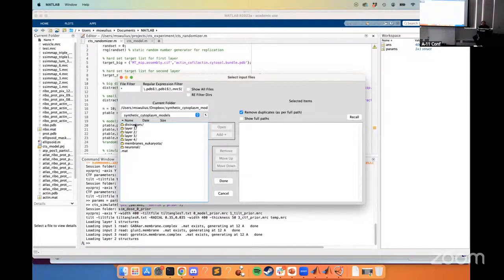Okay, you see how I have this folder called distractors? It's basically a copy of the other 4 folders. But if you open them up, every file has the word distract in it. And if you pass those PDBs to CTS, then it knows that it shouldn't make them a class target in the final ground truth. And it just puts them into the background for you.